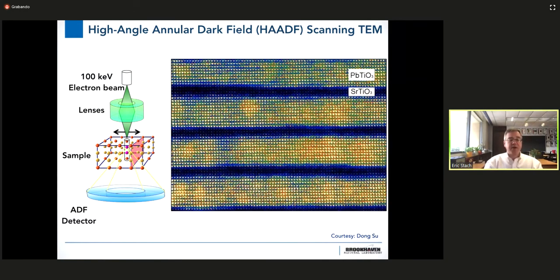And because our focused electron probe is so small, as we scan along we'll see, oh, atom core. And when we hit the atom core, the beam will scatter. It'll scatter to a variety of angles. And then when we go over further, oops, all of a sudden, we're no longer where the atoms are and the beam transmits through.